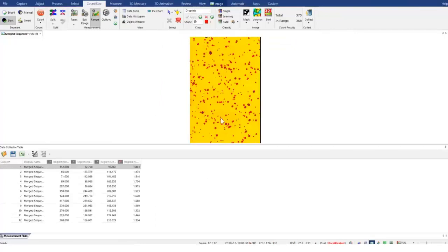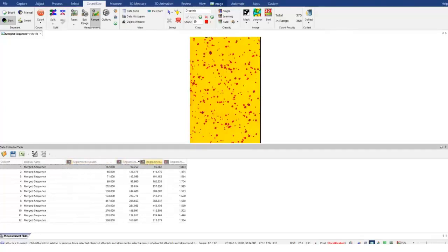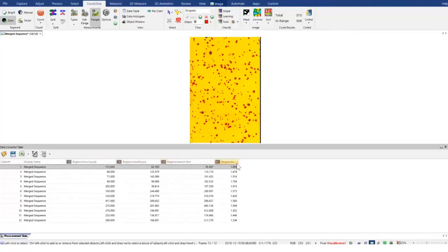This time, I've now used the data collector table file to collect very specific information. So if I didn't care about all the data, if it's not relevant to my particular experiment, my particular analysis, I just want to know the statistical information for each frame. And now I can count the number of objects per frame. In this case, I selected the mean size, standard deviation, and the mean aspect ratio.